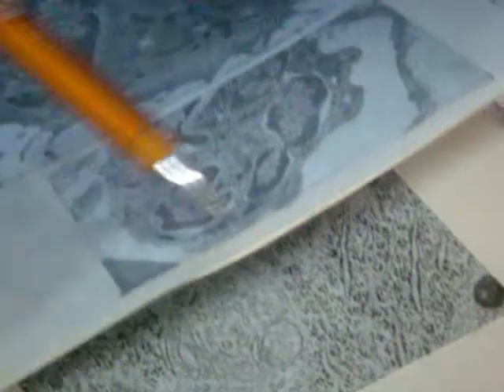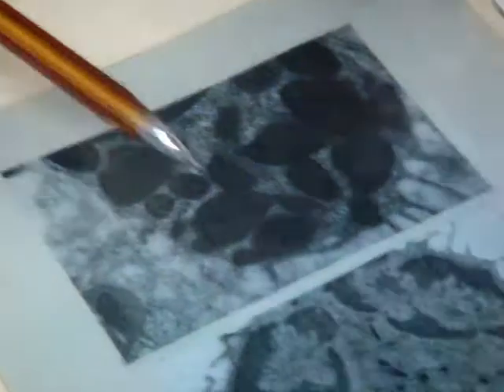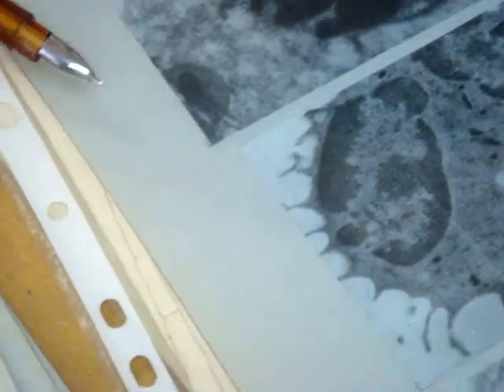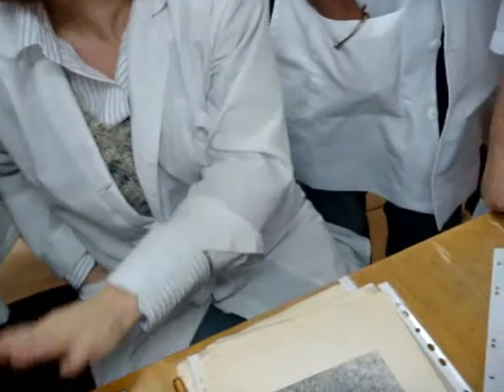Because granules are very small, this may be a neutrophil. This also has a highly segmented nucleus, a neutrophil in the lumen of a blood vessel. We can see it next to the endothelial cell. In this cell we can see very large granules. It's not a nucleus with such processes, so because of very large granules, this is a basophil. Teacher, is it an eosinophil? In the eosinophil, we can see a special type of dark granules, elongated, with a crystalloid in the center. We can't see a crystalloid here, so it can't be an eosinophil.